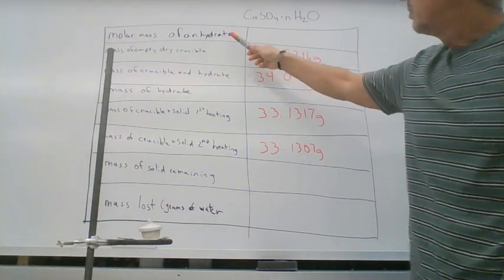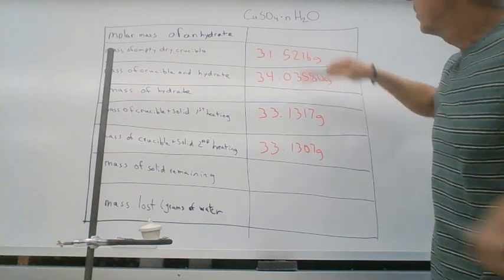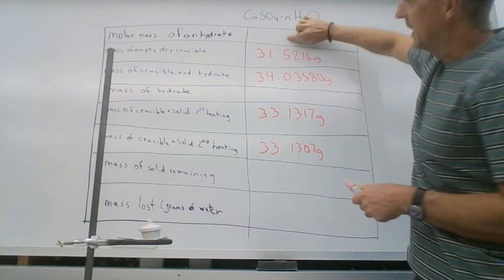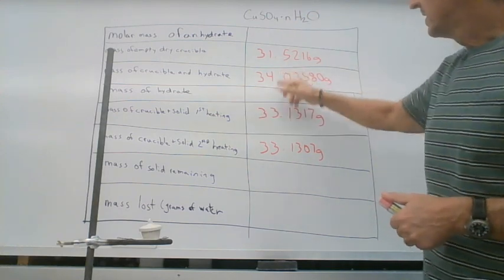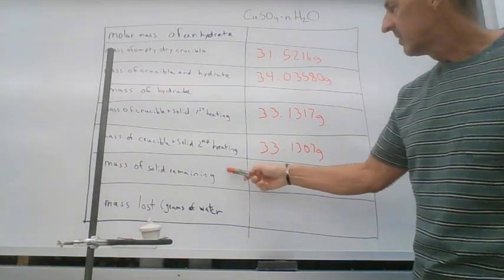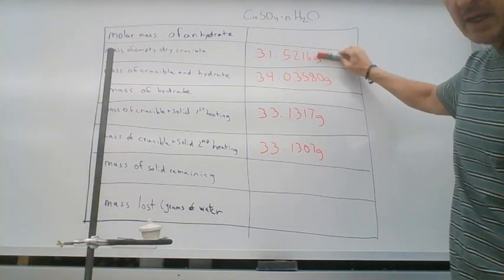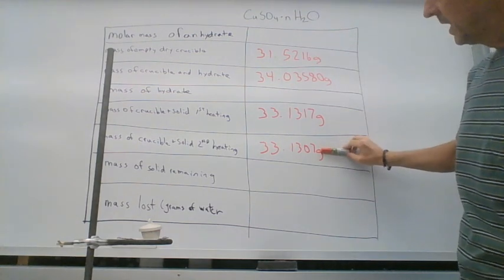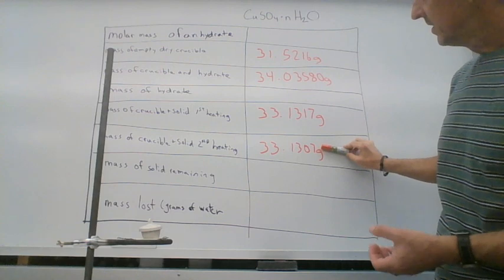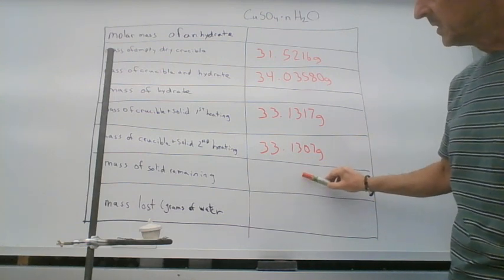You're going to figure out the molar mass of the anhydrate. The anhydrate means without the water, so this would be the molar mass of just copper sulfate. The mass of the hydrate is the difference between these two numbers. Then the mass of solid remaining is, this is what the crucible weighed empty. This is what it weighed after we heated it. So all that's left inside of it is the solid remaining. So the difference will be the mass of the solid remaining.